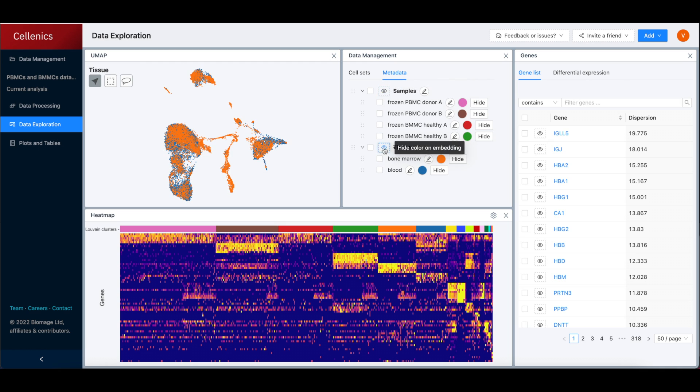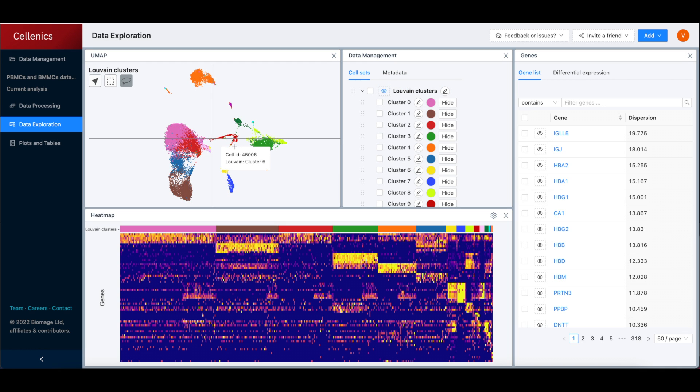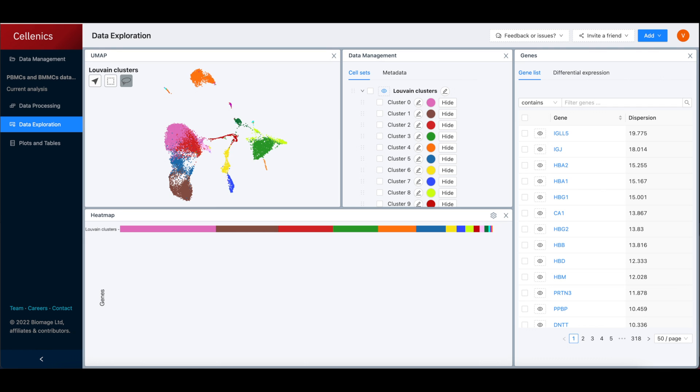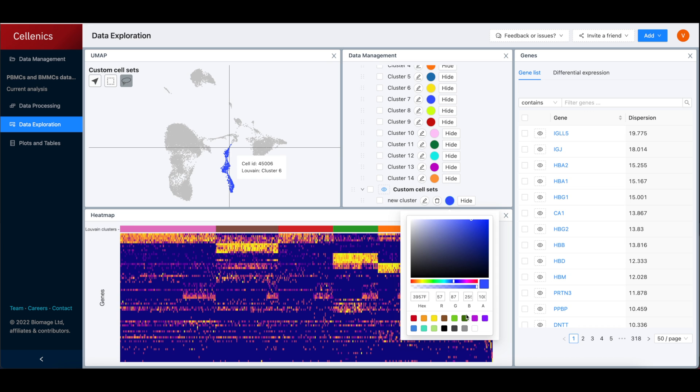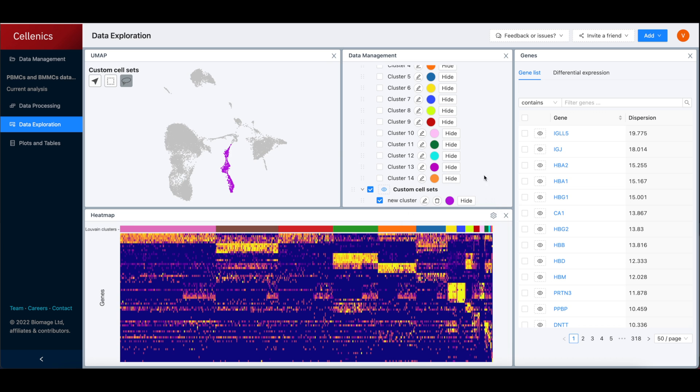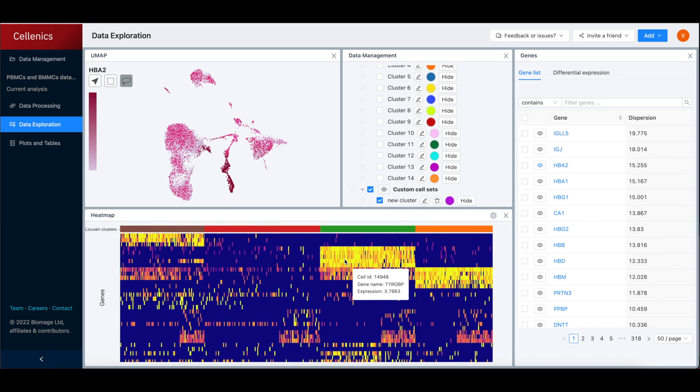The data exploration module then allows researchers to rapidly gain meaningful insight into their dataset. Common visualization tools such as UMAP embedding and marker heatmaps are shown by default, enabling researchers to visualize their data in a single click.